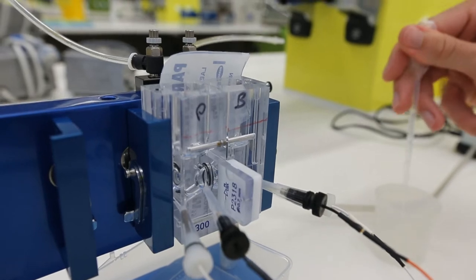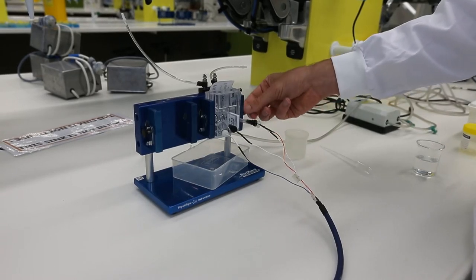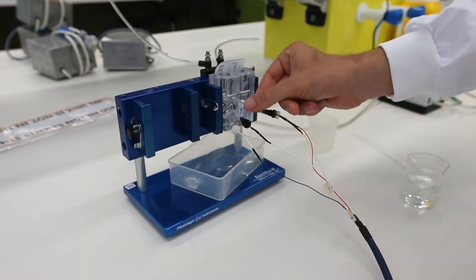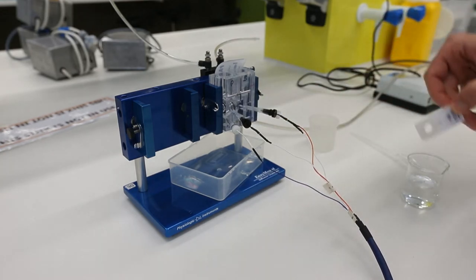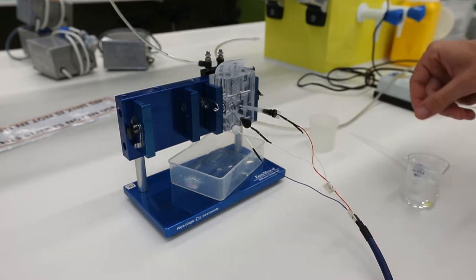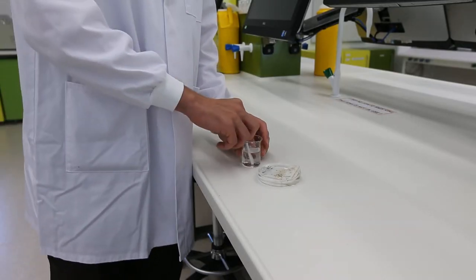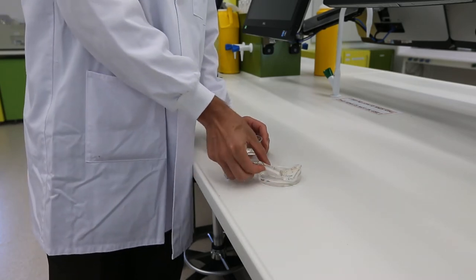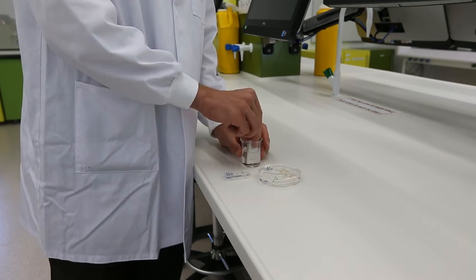To remove the tissue holder, undo the knob on the side of the frame and raise the arms. You can now remove the slider. Next, take your beaker of Ringer's solution to the teaching station, where you will receive a tissue holder with some toad skin already inserted into it. Do not touch the skin mounted within the tissue holder, as this would likely stop the skin from functioning.